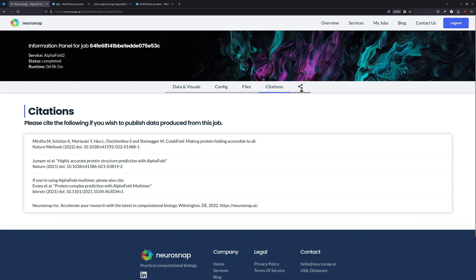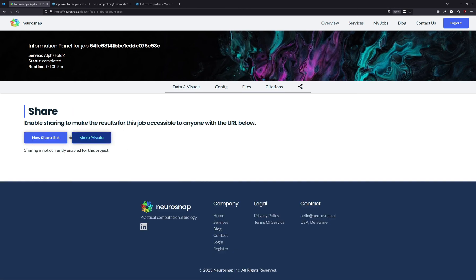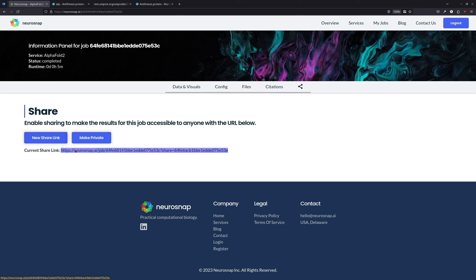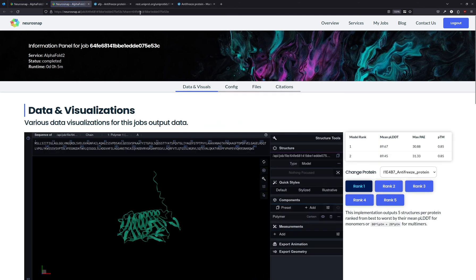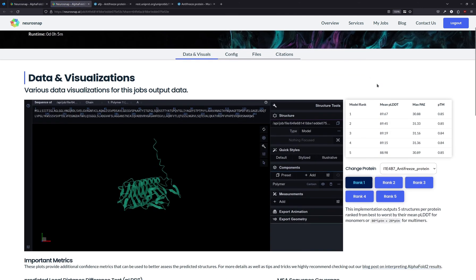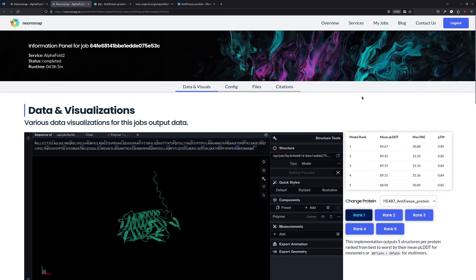And finally, we have citations and the option to share. So if you want to make this job shareable to anybody, you just click this button over here. You can hit this link and share this link with anybody, and they'll have access to everything.